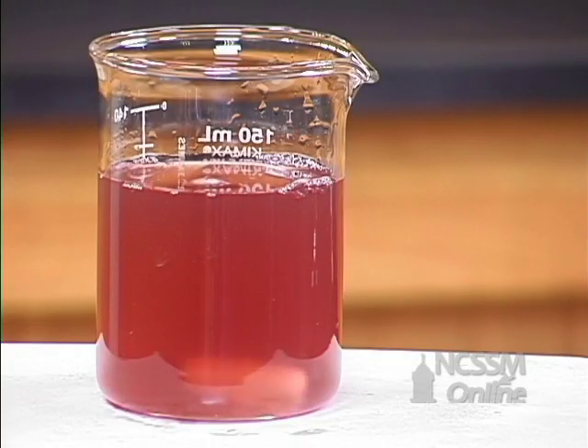Here we have a beaker with some water and some red cabbage juice. I'm going to add some base to the solution so that we can see the basic color of the red cabbage. Then we'll slowly add acid to the solution and see the different color changes.